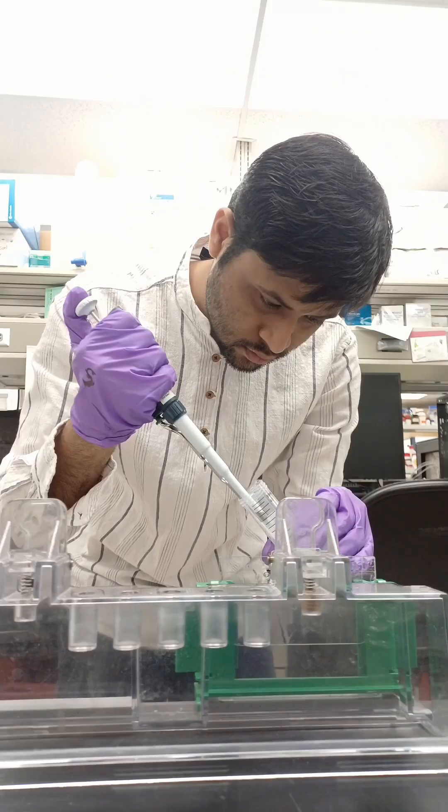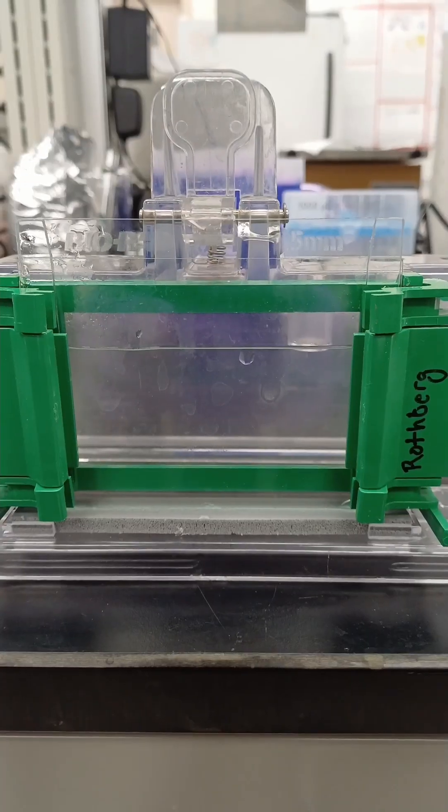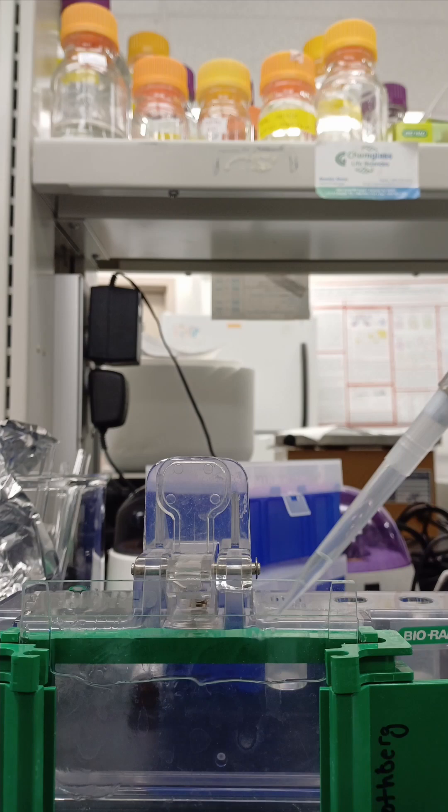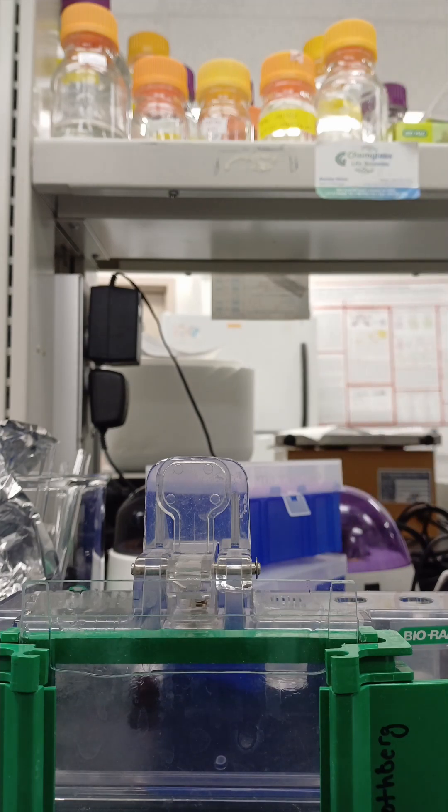Now remove the water and pour the resolving gel using a pipette. Leave about 2 cm of gap at the top for the stacking gel. Now add a thin layer of water or isopropanol on top to even up the surface and speed up the polymerization.